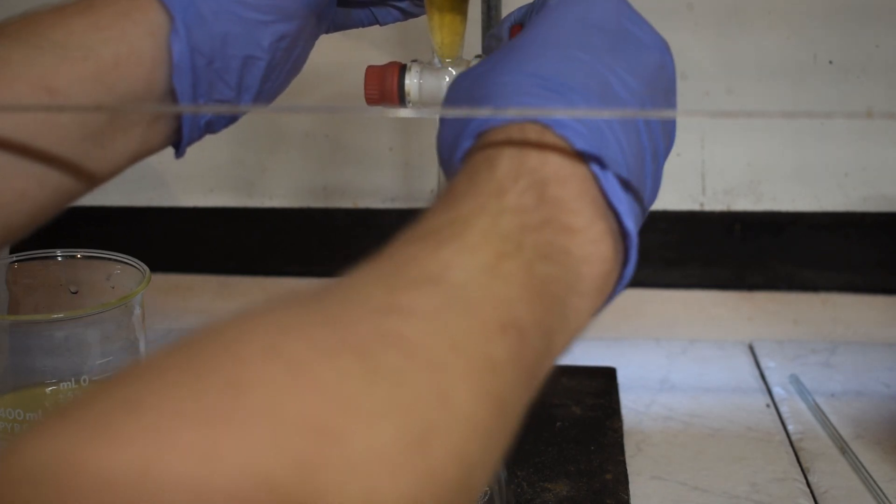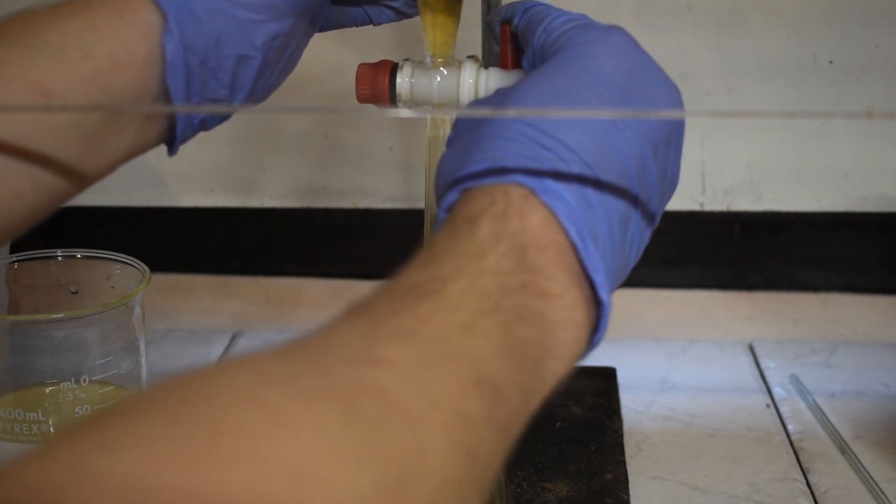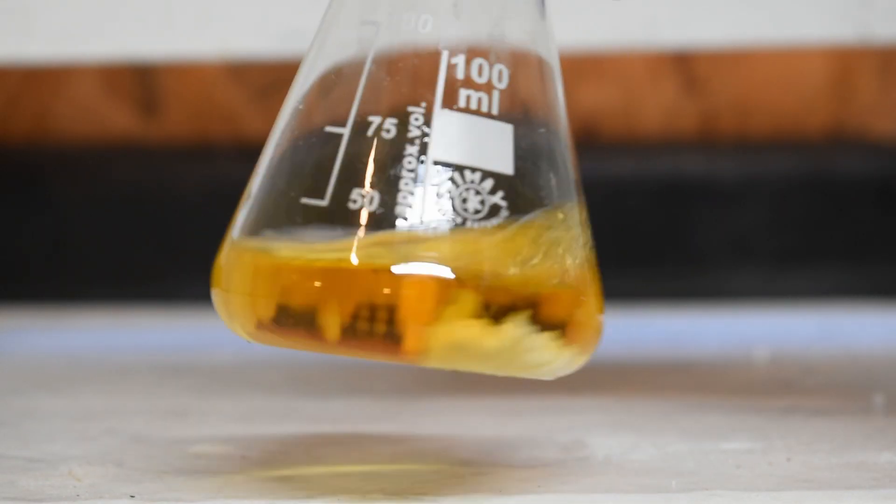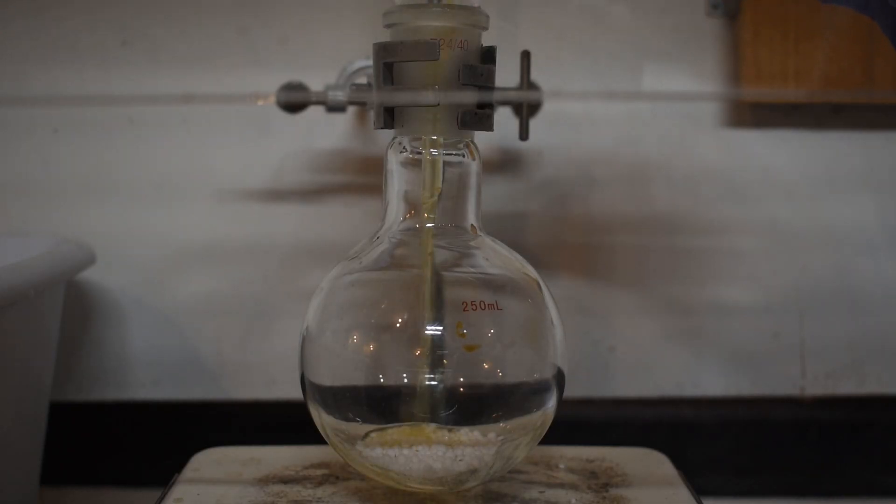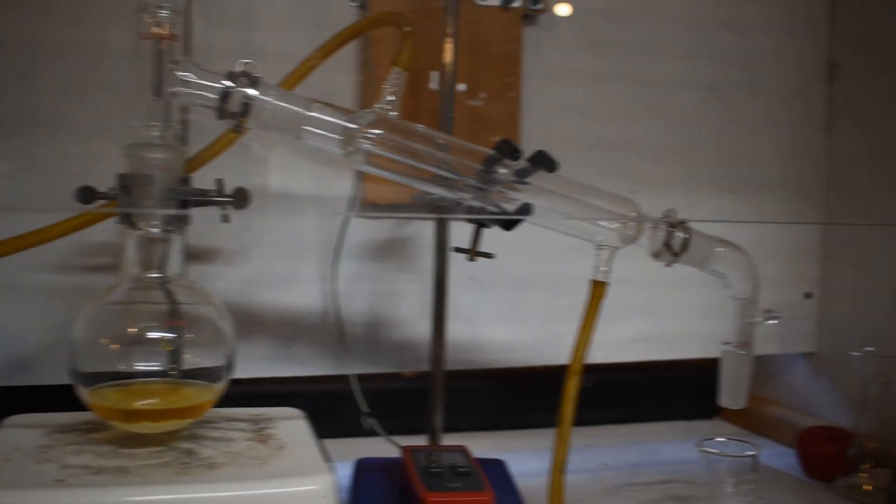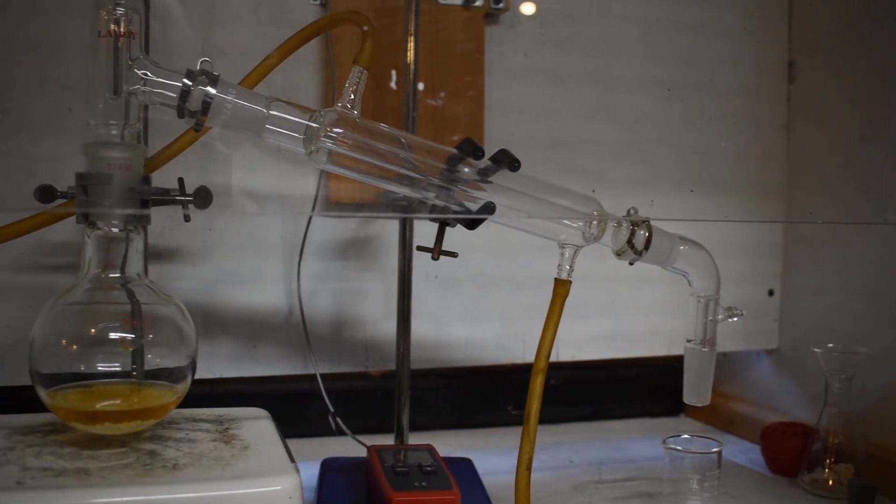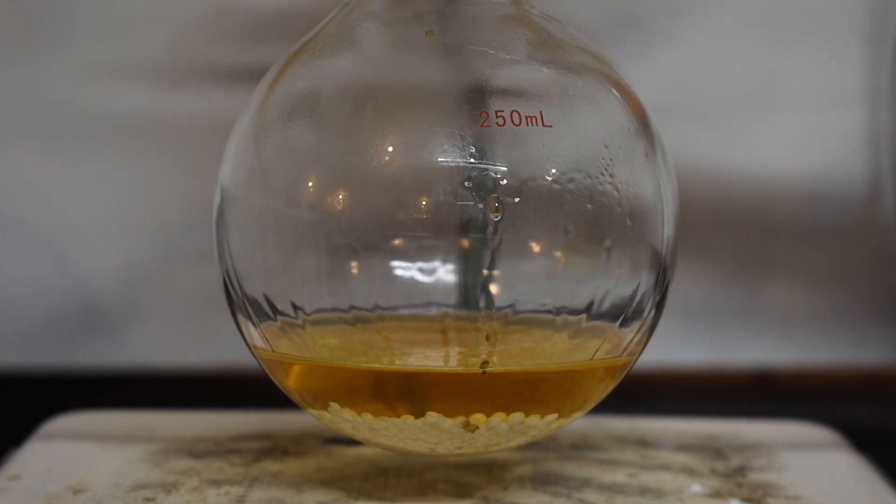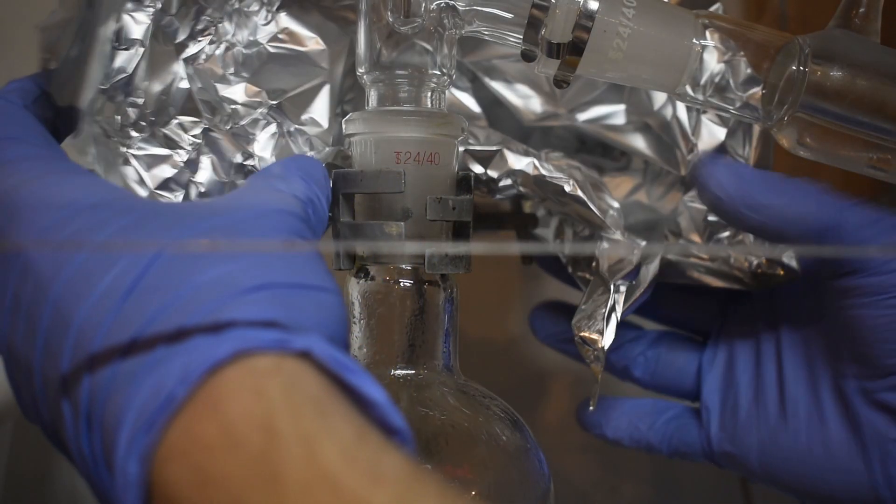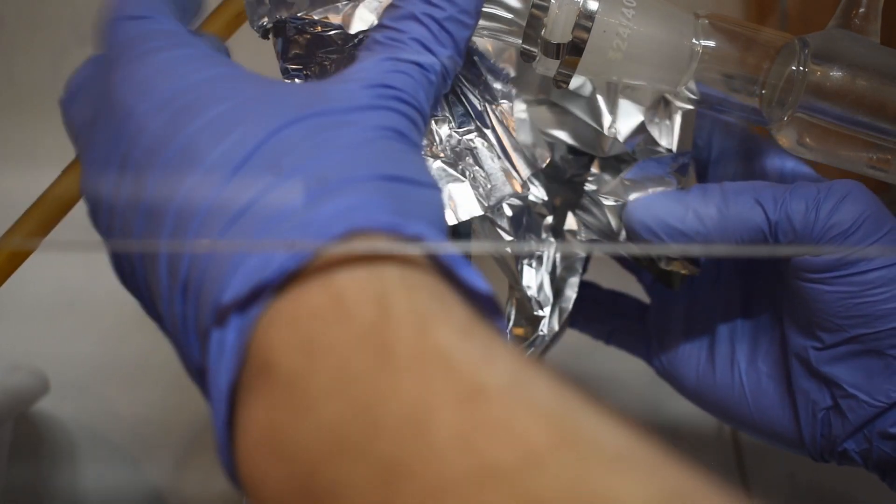I transferred our isoamyl acetate over to a small Erlenmeyer flask and then added some calcium chloride to help remove water. After this, I transferred it to another round bottom flask that also had some calcium chloride in it as well. I then set up for distillation. I covered the reaction flask and the still head in aluminum foil to help insulate some of the heat.